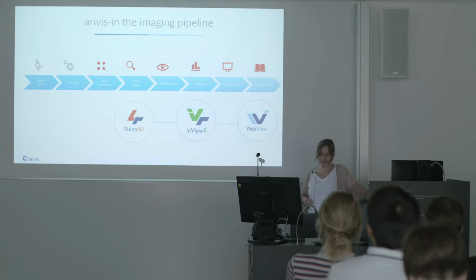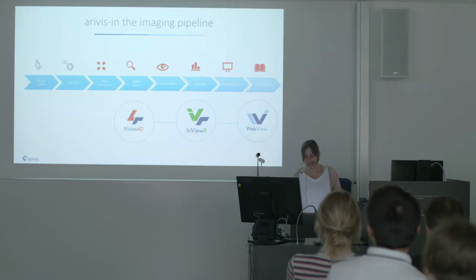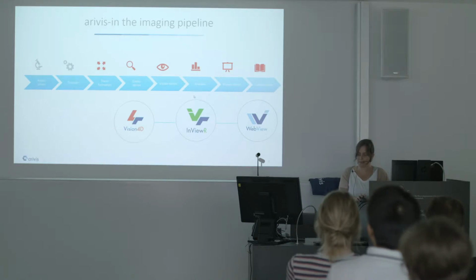So basically you will find our solutions from what we call transformation, and we will be giving you some examples here. Visualization, creating movies, animated movies, making screenshots to share it with colleagues, as well as doing analysis, whether this is manual or whether this is by automated image analysis.